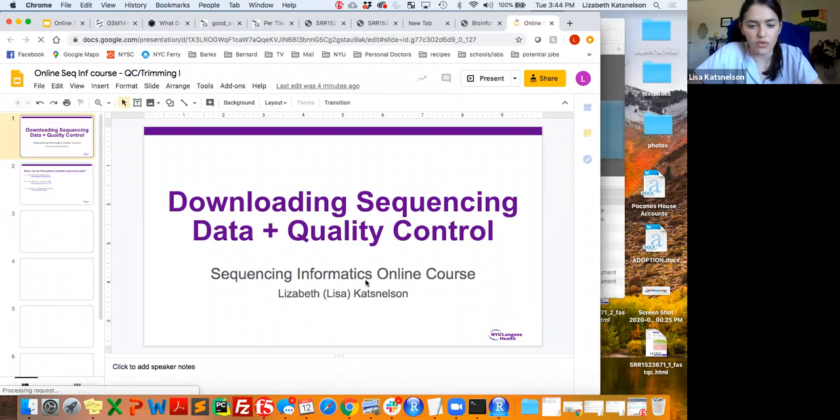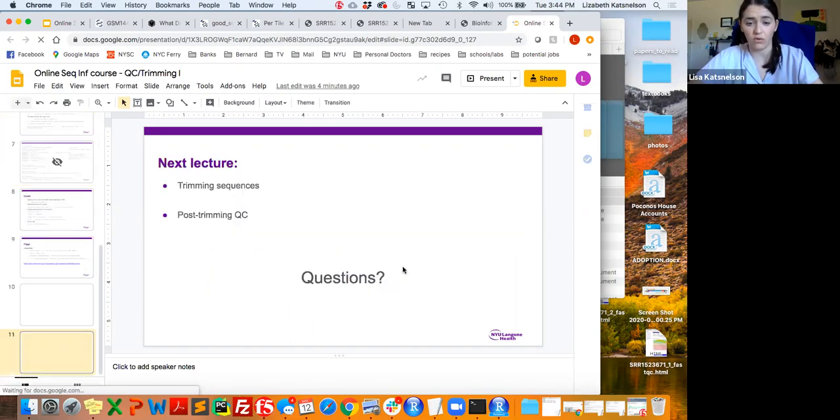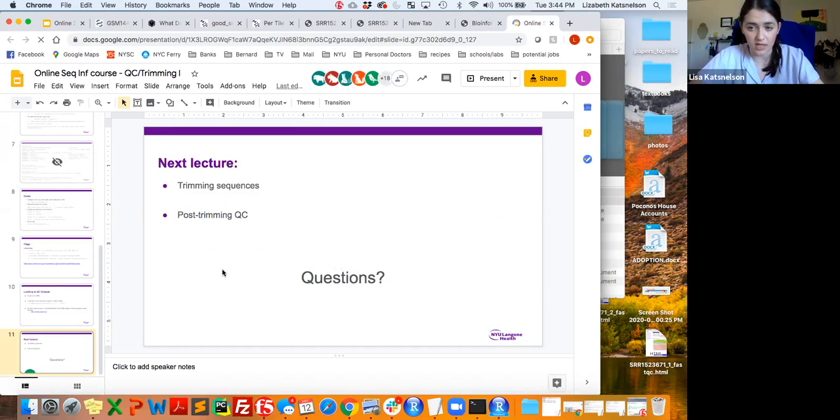So the data you can actually download yourself if you're using prints. I'm not sure we'll have these folders ready for prints by Thursday. I'm trying my hardest. But you should be able to run that script, that .sh shell script, to download the data yourself. But hopefully we will have a folder available on prints. So sorry about that.